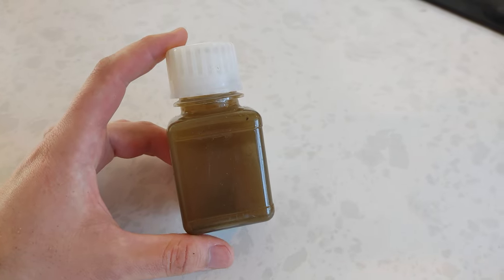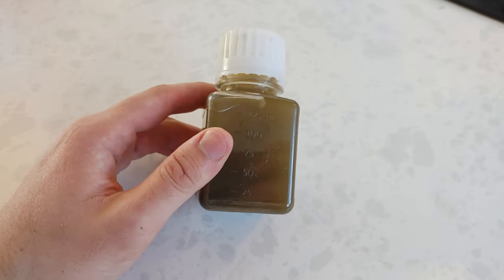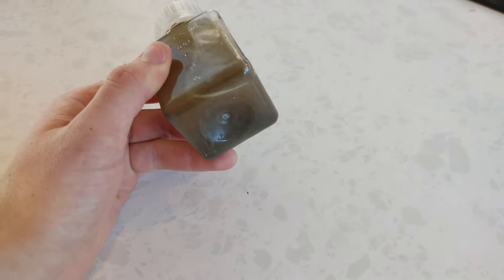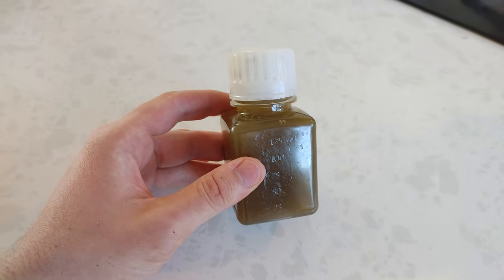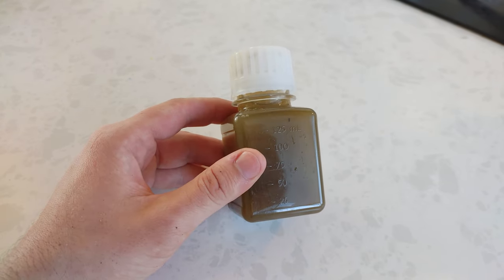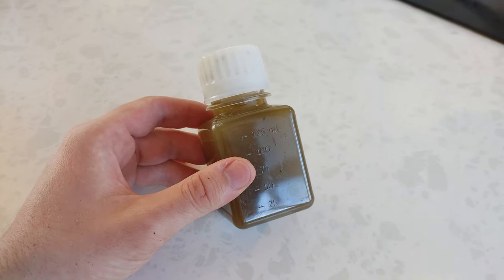This is what the collected plankton looks like. It's also got a bunch of silt and sand that got through, but I'll let it settle out and we'll get a better look at it and then put it under the microscope.